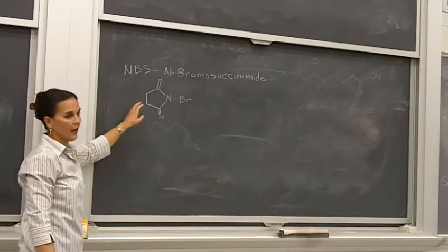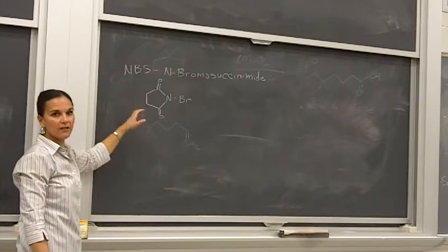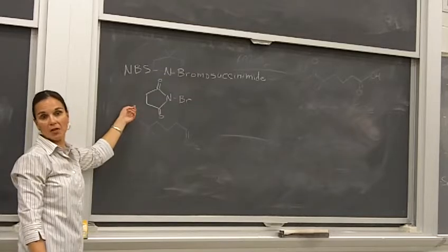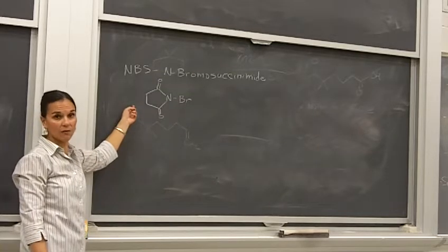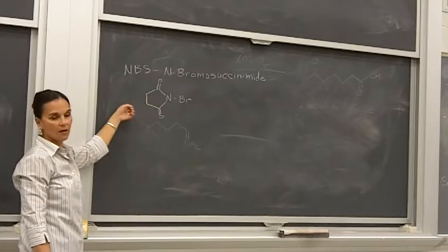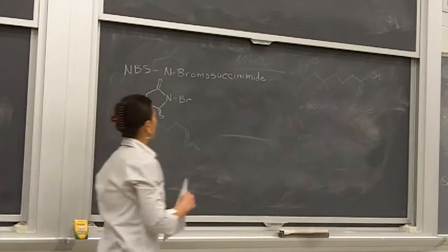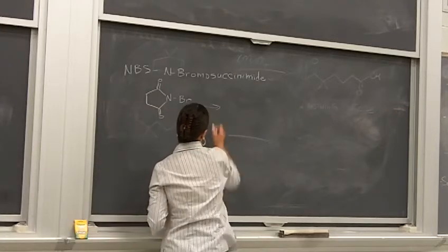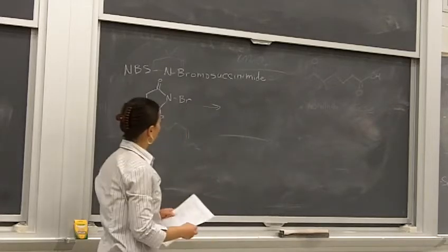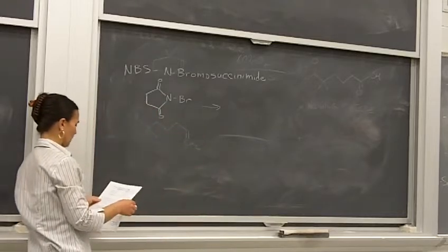And the reason we're doing that is because as the reaction progresses, it slowly gives up its bromine, versus if we just put Br2 in that reaction, we'd have a really hot, really fast, maybe out of control reaction, okay? So this is our source of bromine, is the N-bromosuccinimide. Once it reacts, gives off its bromine, then it forms a byproduct succinimide that we'll talk about here in a little bit, okay?